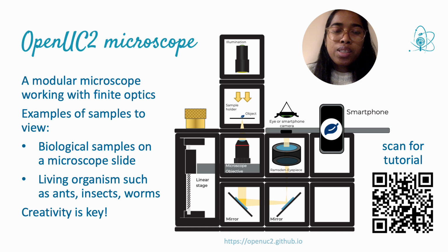The light source would require some battery to run. Then the sample will be placed in this sample holder. So the light source will be this, and the sample holder will be placed at this position.